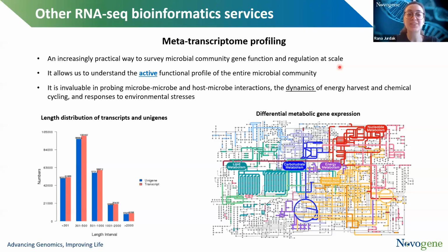I guess you answered the second part of the question, which was, what is the depth you could recommend for a more detailed or in-depth analysis? That really depends. You need to think about the complexity of the genome, and also what information you want to get. Do you just want to look at expression level on the surface? That can be slightly shallow. If you really want to identify splicing events, that requires more. And also if you are going to do enrichment of the RNA you're looking at, or you're not going to do enrichment and just want to sequence everything, and you require depth to identify those rare transcripts, then that means the sequencing depth needs to change as well.